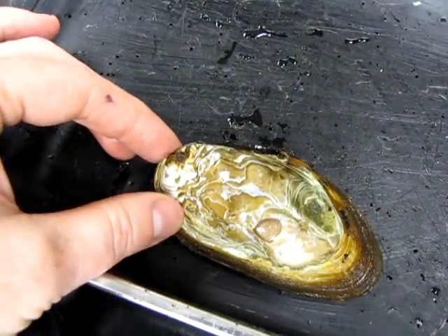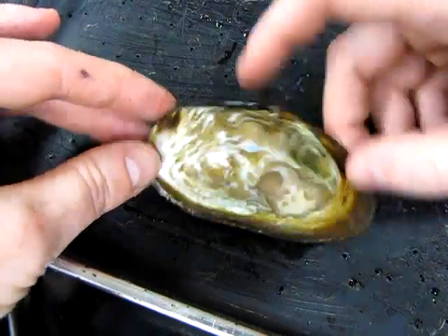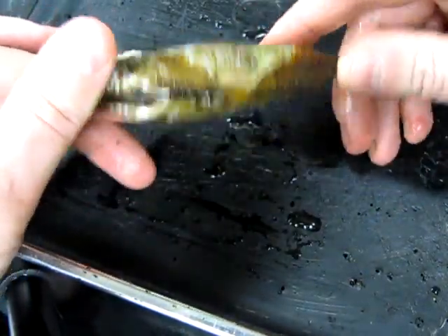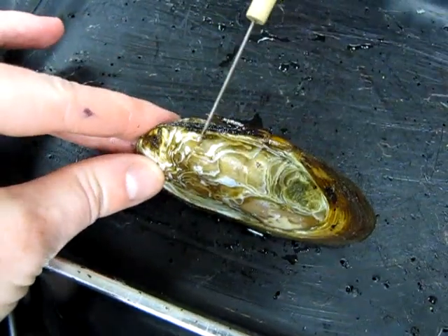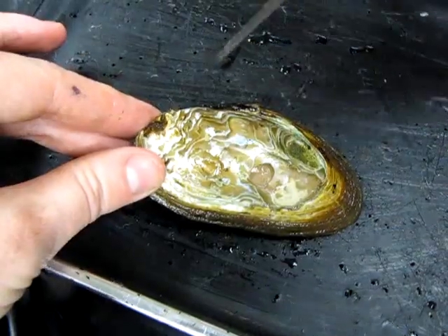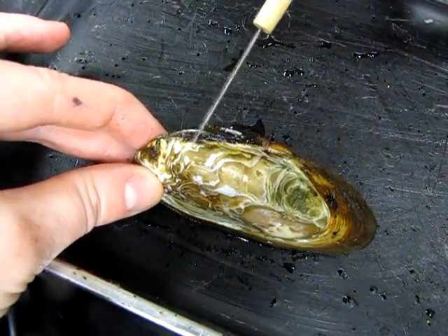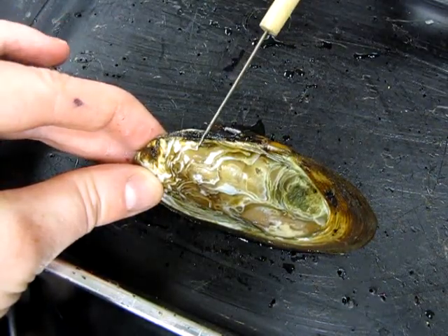I'm going to start off by showing you how to orient yourself on the animal. It's not very intuitive — there's no obvious head or legs or anything like that. The first thing you want to look for is this slightly swollen area here, a bit of a hard hump off to one side. That's called the umbo, and the umbo is the oldest part of the shell.